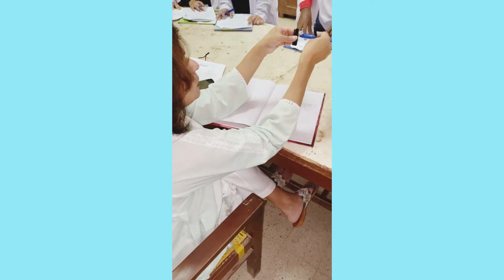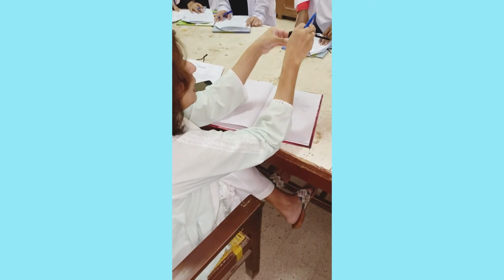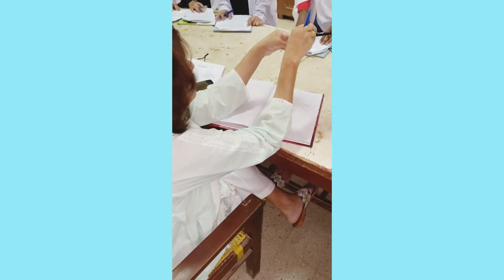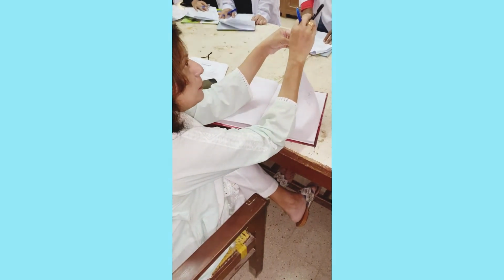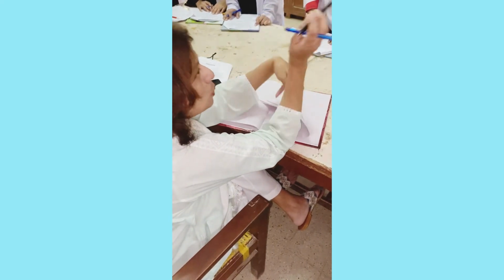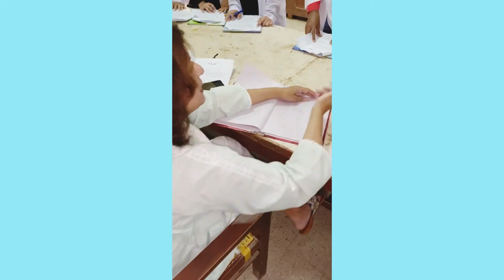Don't do it in a harsh way. No, slowly, gently. You need to be very gentle when you are pouring water over your prepared compound. Sometimes it happens that you pour suddenly and all the compound just comes out from the other end. So don't do that, okay? Do it in a very nice, slow, gentle way.